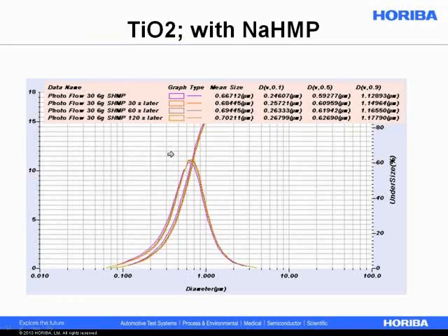And so this actually is much better for method development. Why? Because with method development, we need to have repeatable and reproducible results. And what if the operator puts the sample in and measures it today, but then this afternoon he or she gets a phone call on his cell phone, and it doesn't do the measurement till 30 seconds later? If you use DI water, you would get a different answer. If instead you dispersed it in sodium hexametaphosphate, if you lose a few seconds talking on your cell phone, that isn't going to change your results so much. So that is a smart idea.